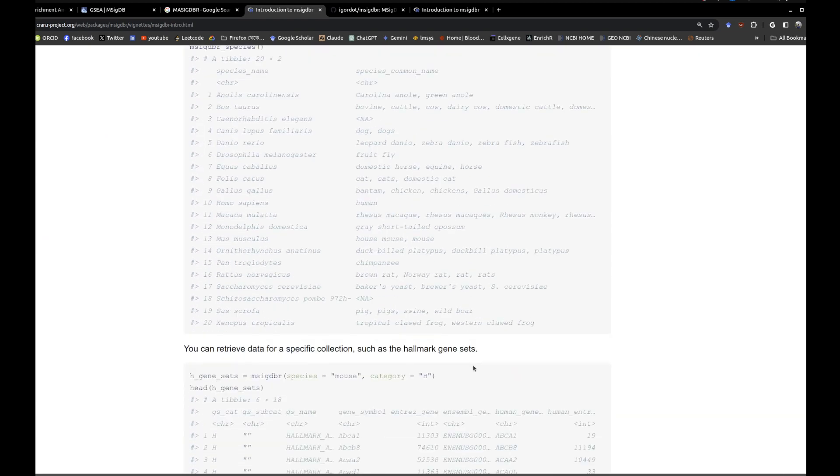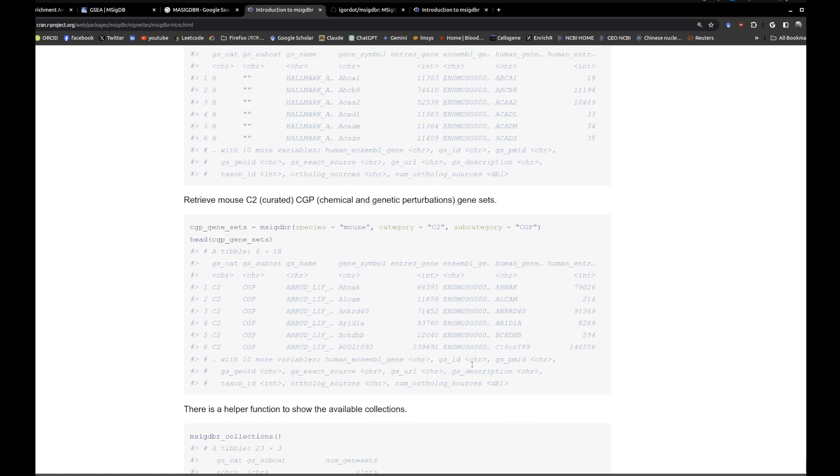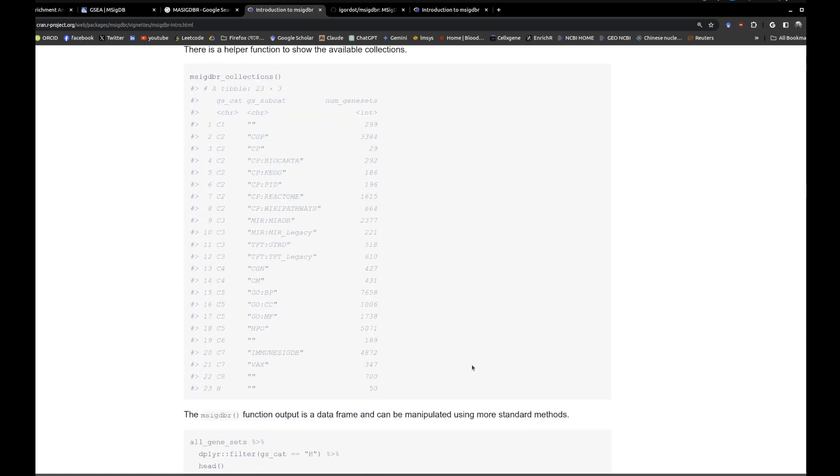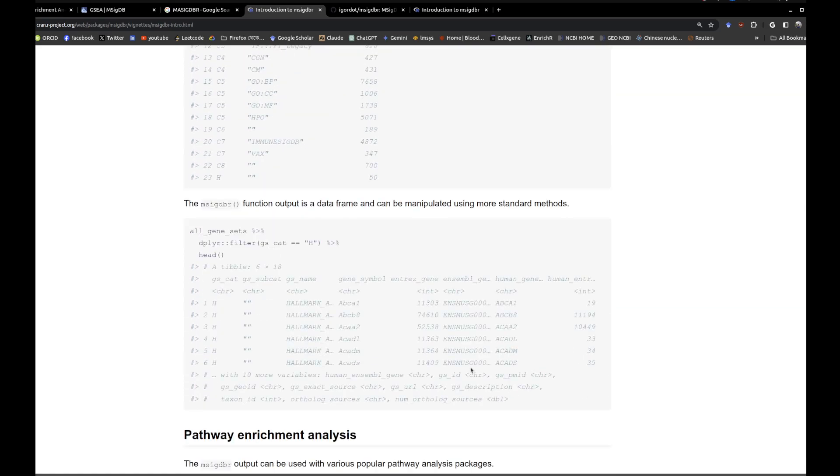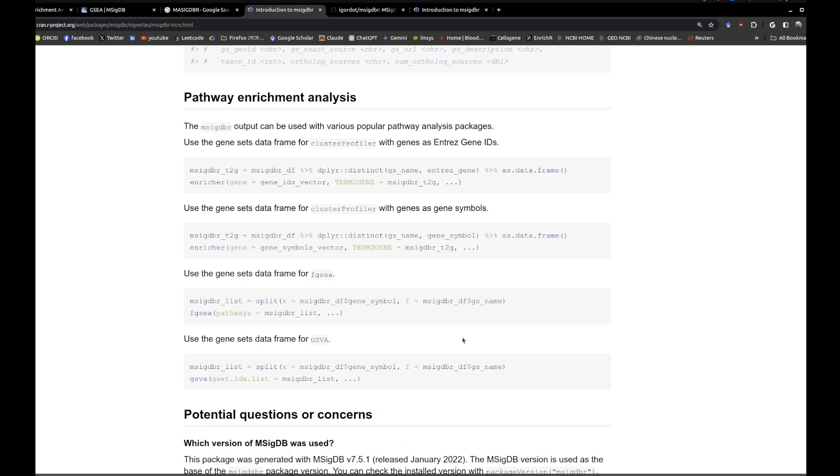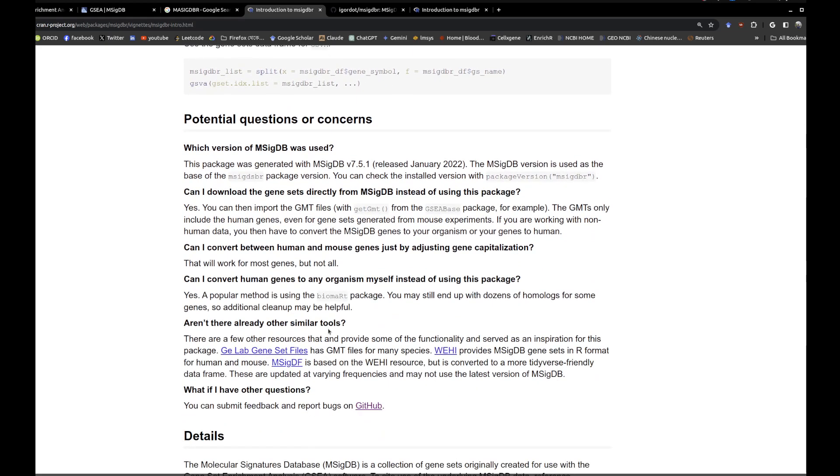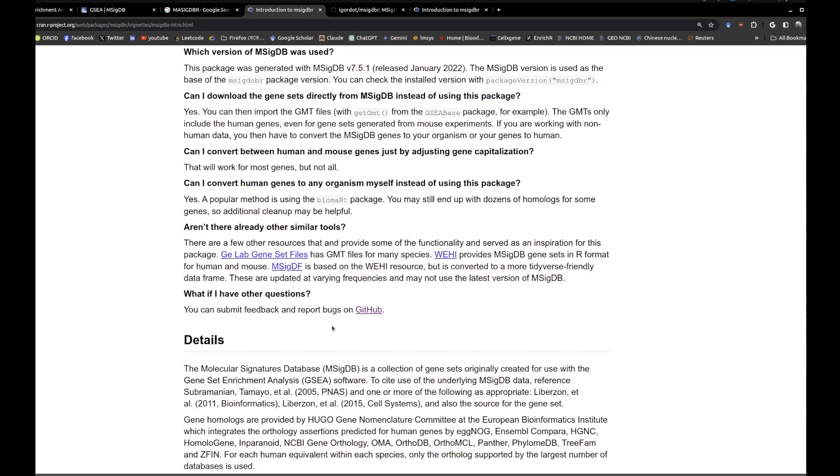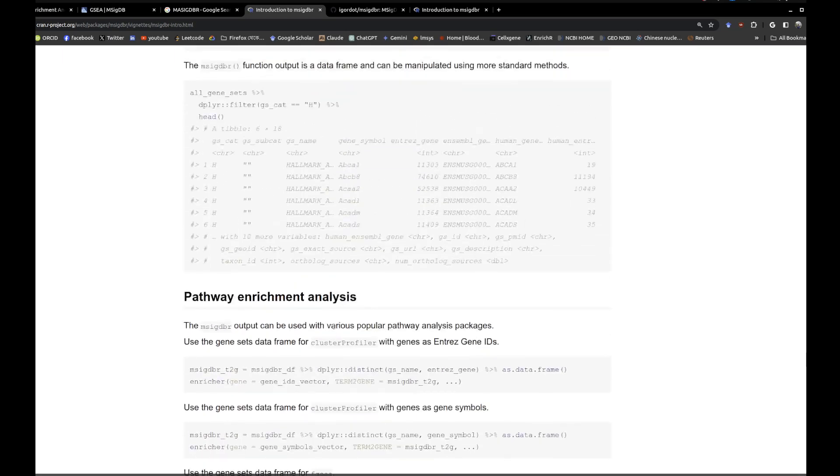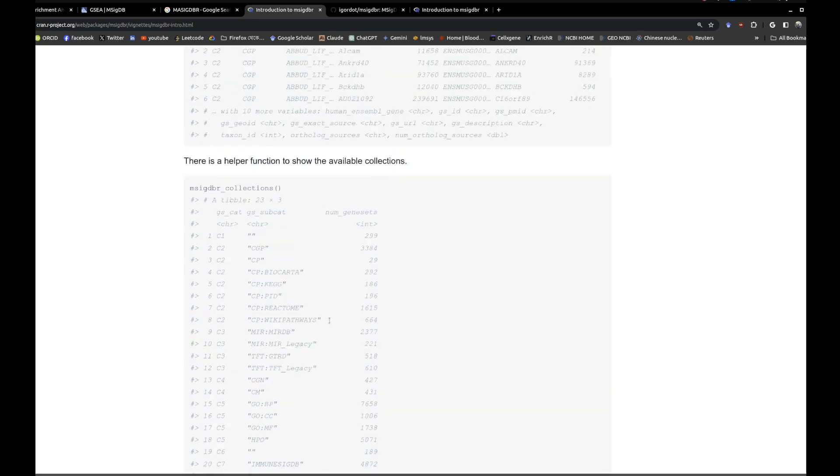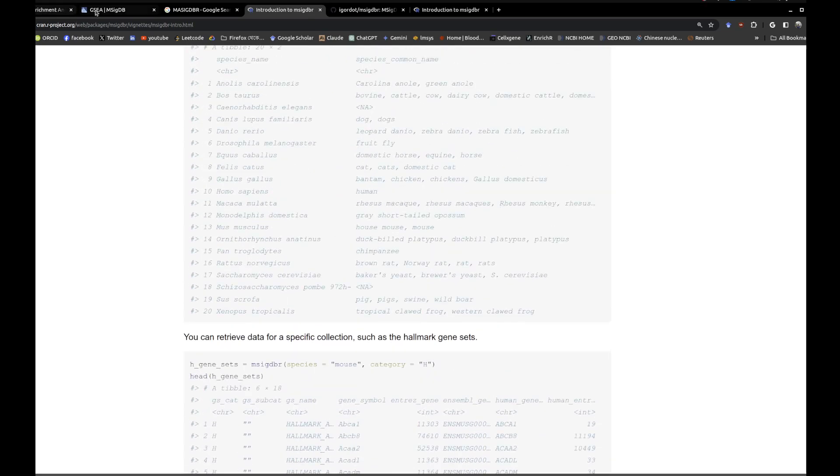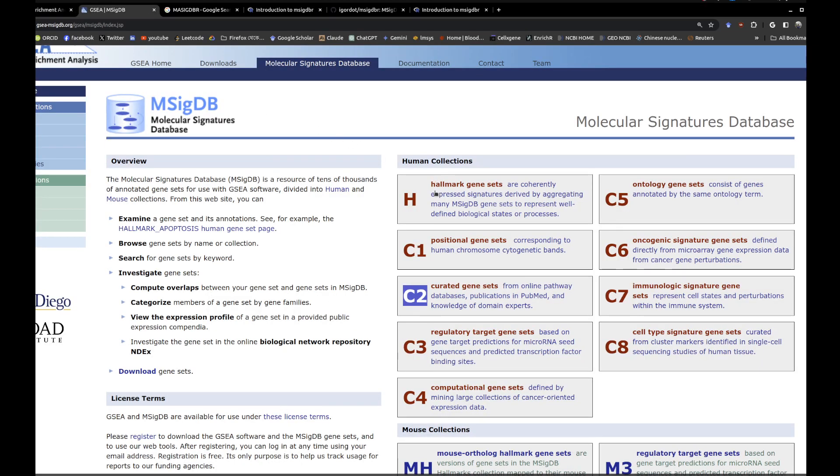If you click on the vignettes, you see the details. There are multiple parts in here - you can run it on different formats and different ways. You can use it along with clusterProfiler, you can use along with fgsea, you can use with gsva based on your data frames.